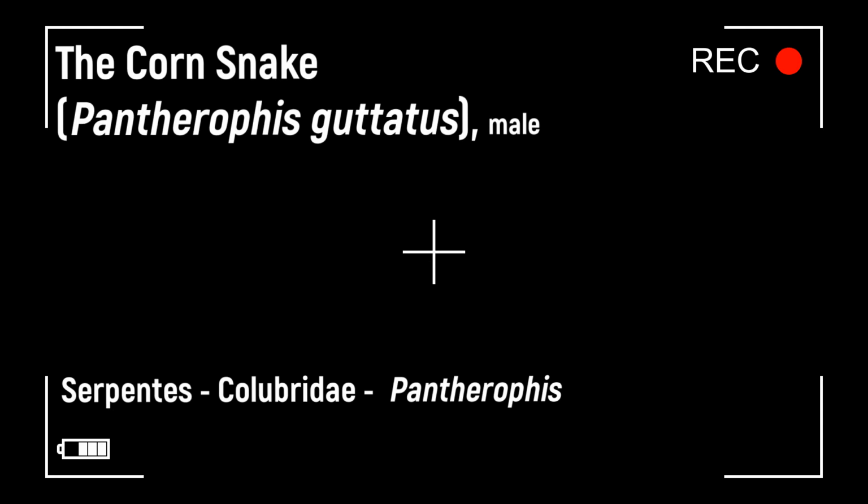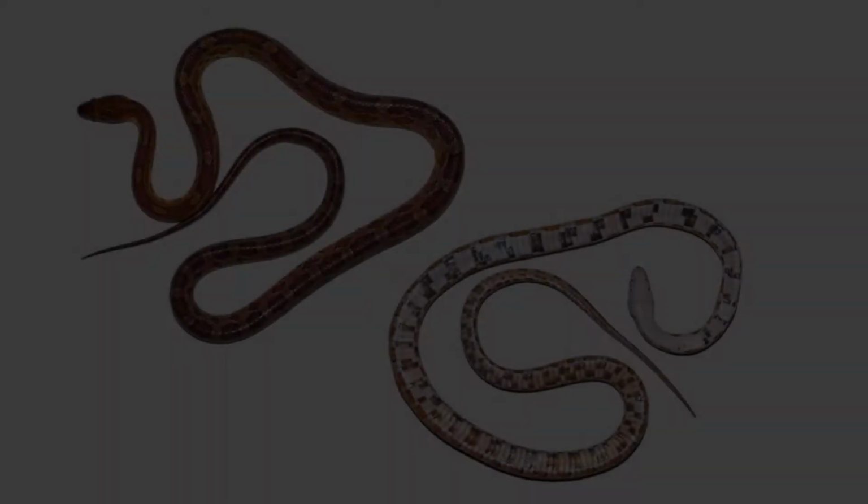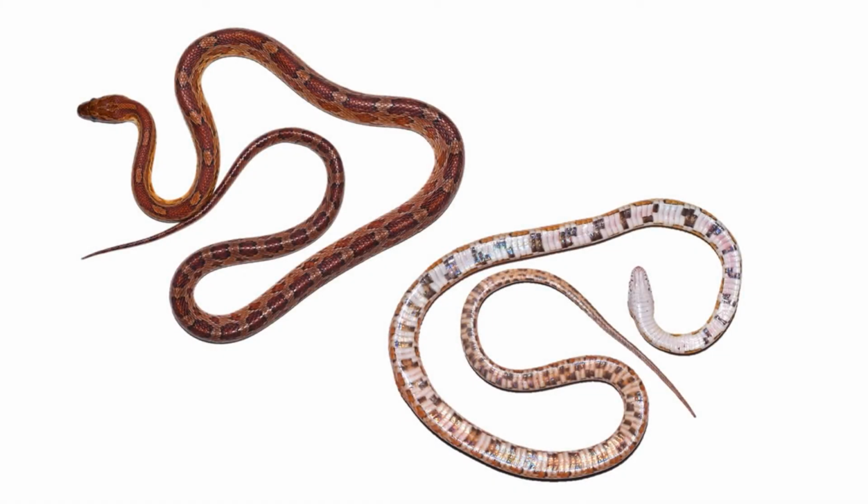Our final subject is a corn snake, Pantherophis guttatus. As mentioned before, snakes were once thought to be an early branch off the squamate tree, but are now known to be one highly successful group of legless lizards. At present, it is not clear which modern group they are most closely related to. All snakes share a series of synapomorphies.